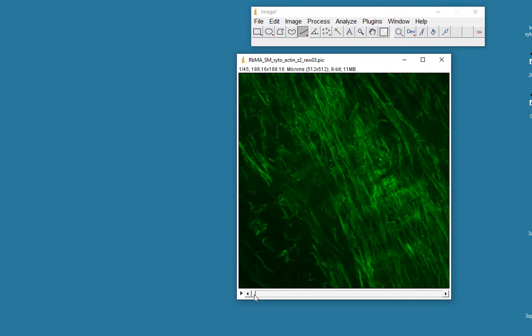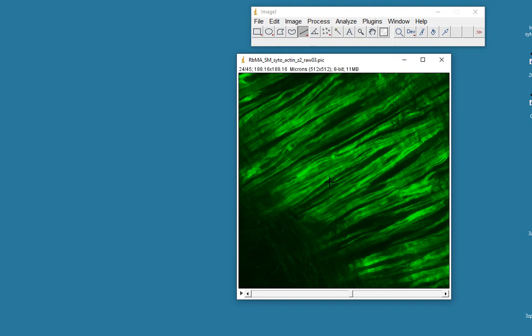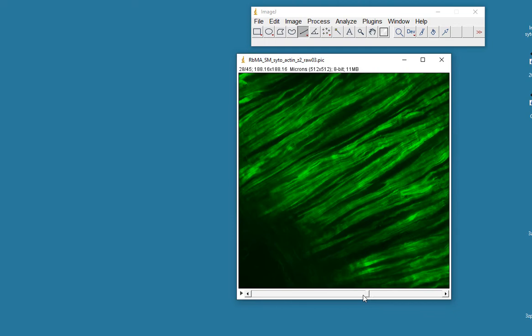Here's our main dataset. We have these fibers in the adventitia, probably collagen fibers. As we move down through the dataset, start to see the smooth muscle cells. Now these smooth muscle cells have been stained with phalloidin, which is a fluorescent stain that binds to actin filaments in the smooth muscle cells. So our smooth muscle cells are showing the long thin, so this would be one cell here with all its actin filaments. Here's another cell here with its actin filaments.